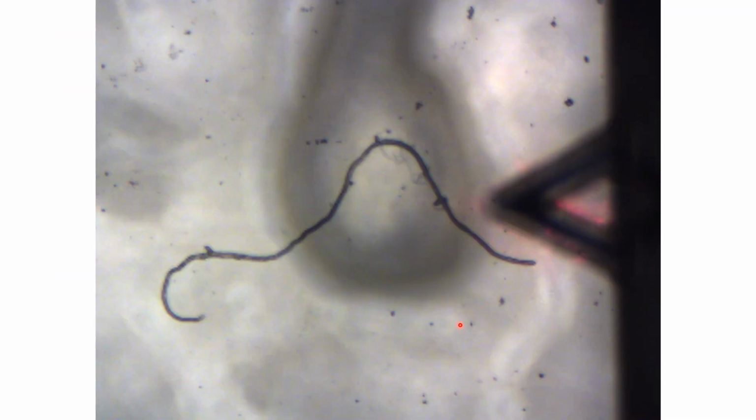Here's an image as seen looking through the AFM optic. Here we have our sharp probe tip, and it is hovering over top of a fungus sample. My current research is partnering with a group from UMBC, looking at mycelium materials and their physical properties associated with them.